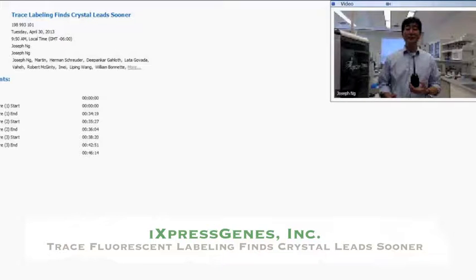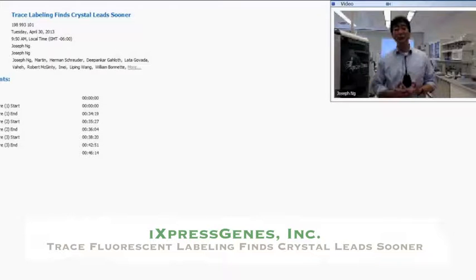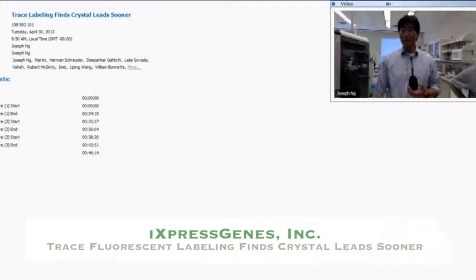We've solved structures directly. Just to clarify, when you label these proteins, the early condition is not necessarily the protein crystal that you can use for structure determination, even though often the case it is big enough to shoot directly. You can do that, but its originally intended purpose is to find the conditions, and then you optimize it with the protein that has and does not have a probe on it. And usually it is pretty consistent in terms of having probes or no probes. So no, it doesn't show up in the electron density map. It doesn't show up in the ultimate structure determination, and the probe is pretty much invisible.